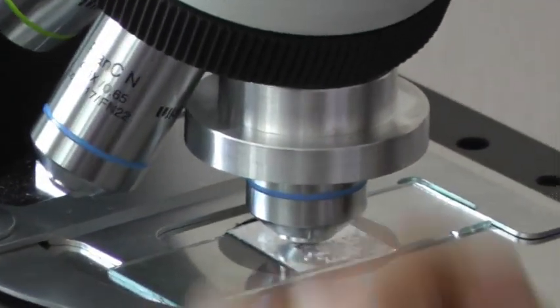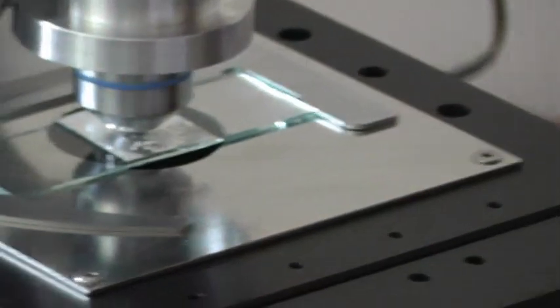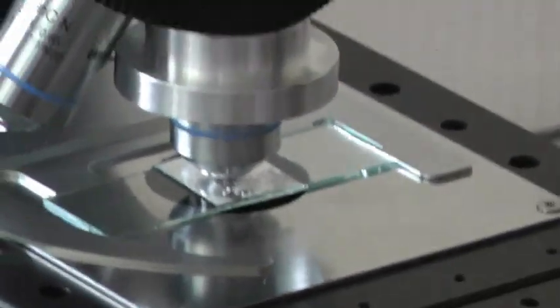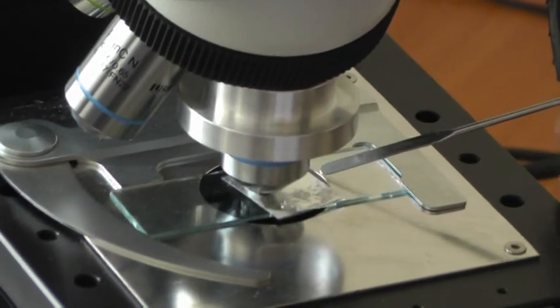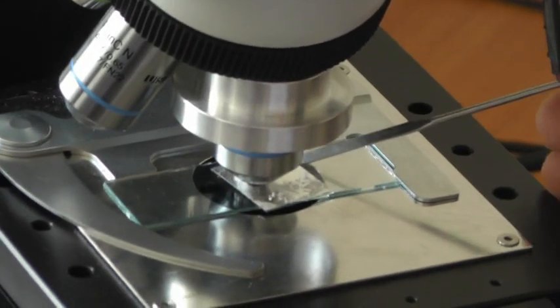I prefer looking at the surface with illumination and see how the particles are distributed all over the surface. So, in principle, they are isolated, and when we turn on the laser and move with steps, say 10 or 20 microns, we will have reasonable statistics of different particles.